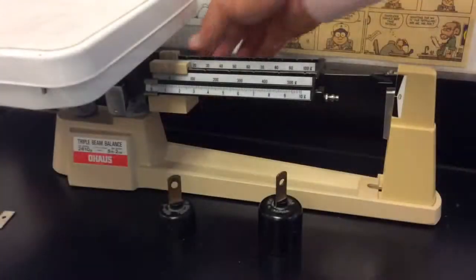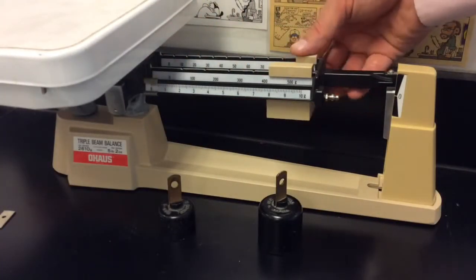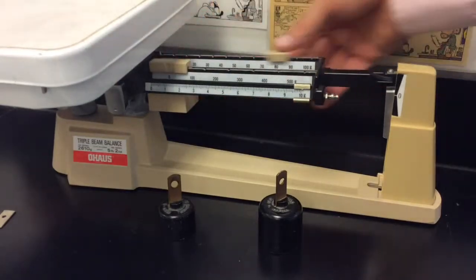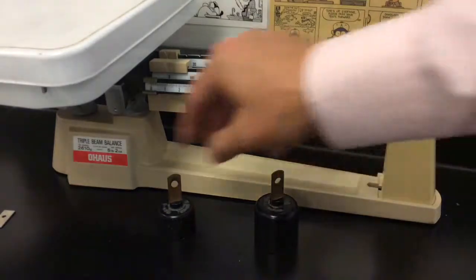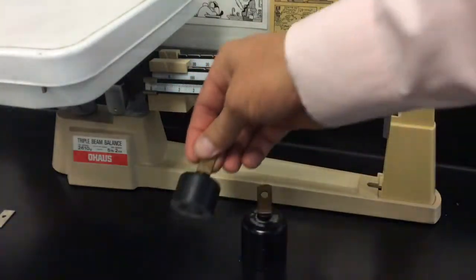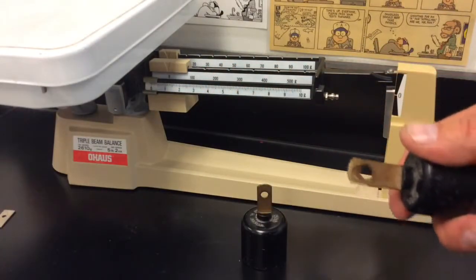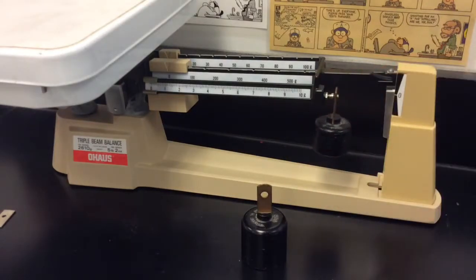Now let's measure the mass of a big scale with this balance. Slide the sliders over and make sure they're in slots. It seems to be beyond the capacity of this balance, but those little hanging masses up in front are designed for use with this type of balance. The big one counts as a thousand additional grams, and the little one counts as five hundred additional grams. You can place them on the little nubbins provided for this purpose.